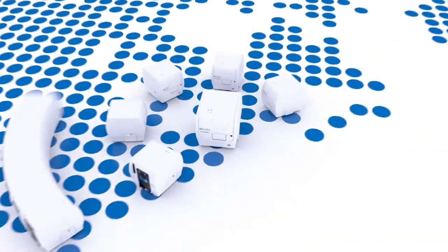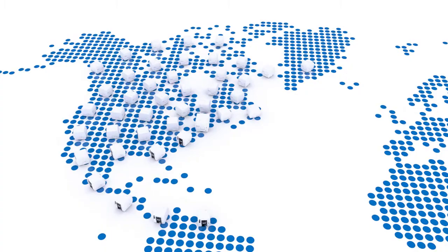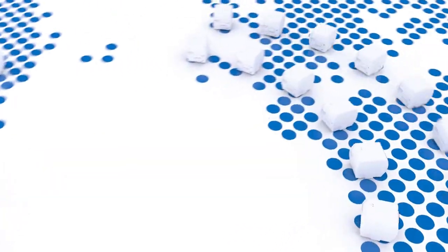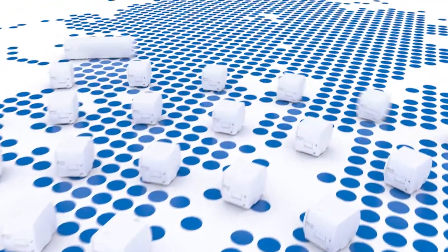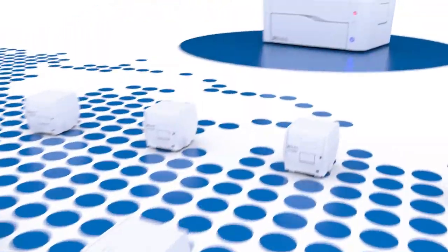Laboratories worldwide use Citation to perform their research across a broad range of applications, with thousands of publications referencing its utility. Now, we have applied the same design concept to bring spinning disk confocal microscopy to every laboratory.